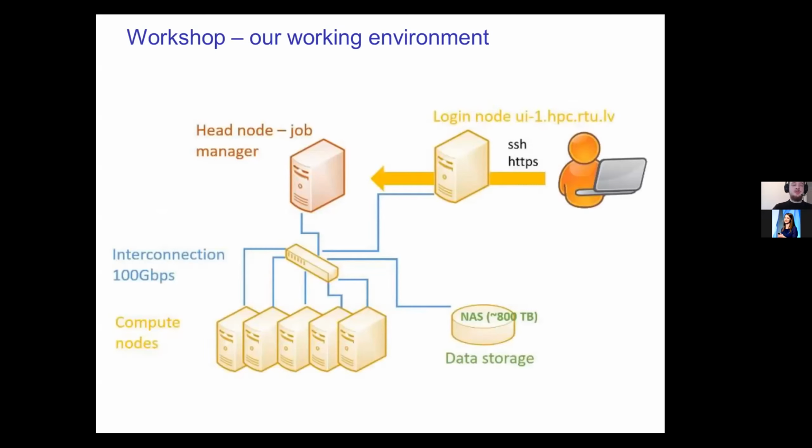Moving towards the end of the presentation. So about the workshop. Basically, we will be working in a high-performance computer today, also called a supercomputer, also called a cluster. Most of the time when you're doing some type of genomics analysis, you will connect to a server.